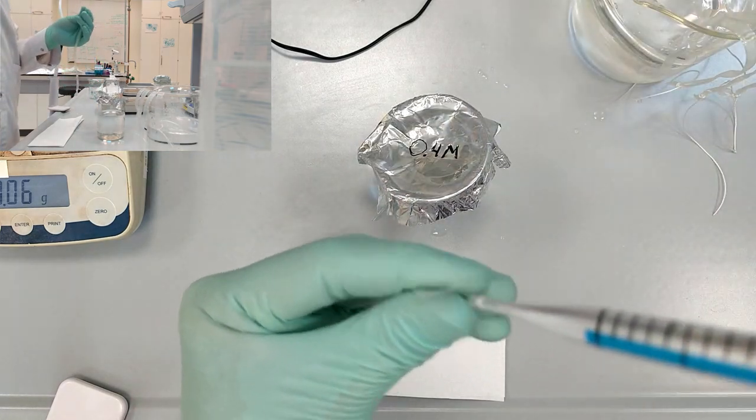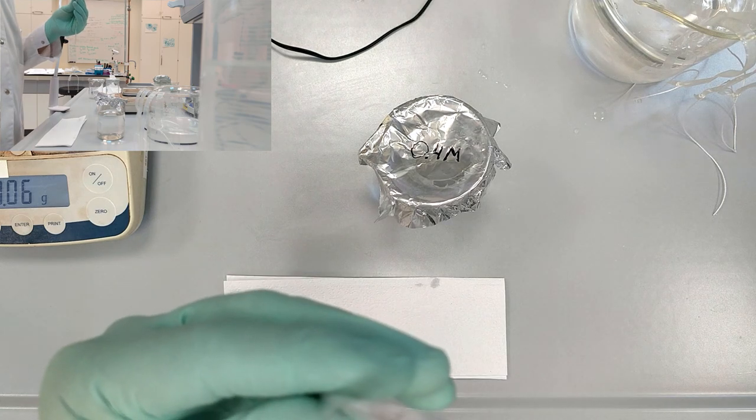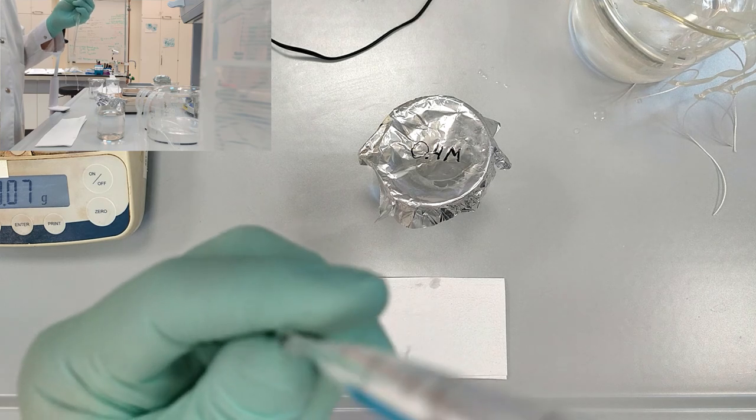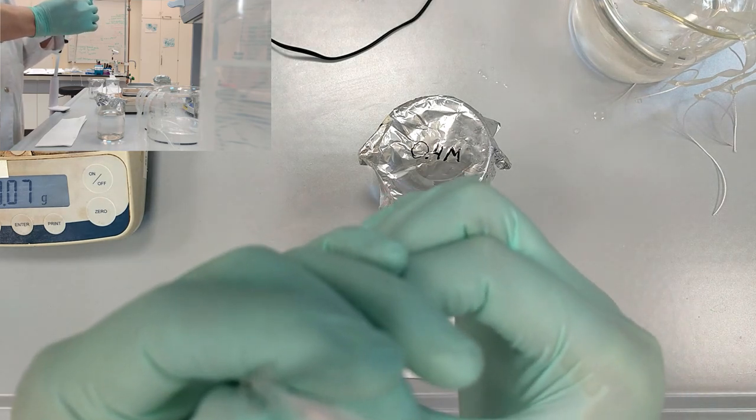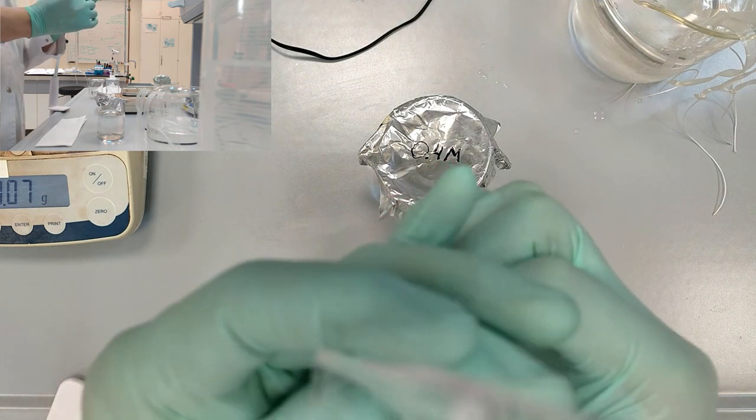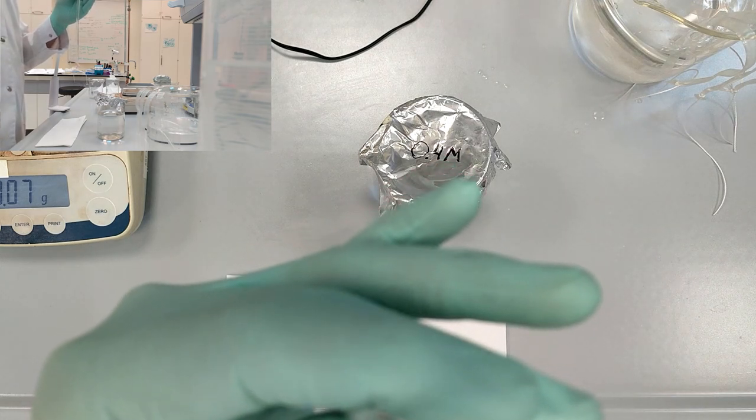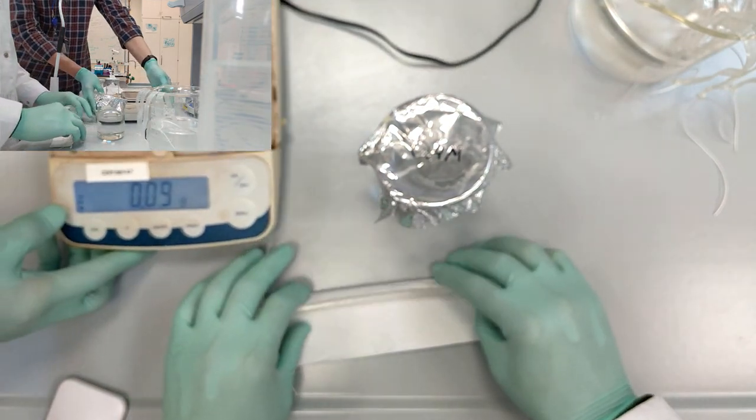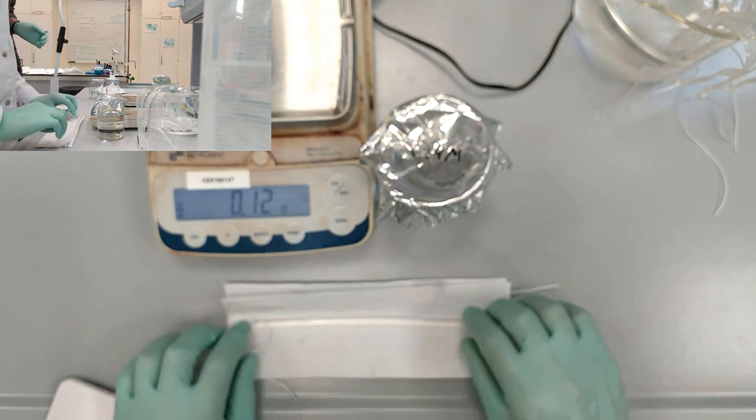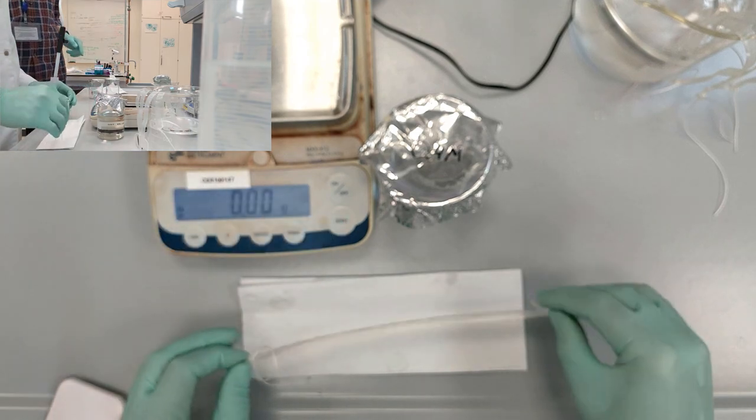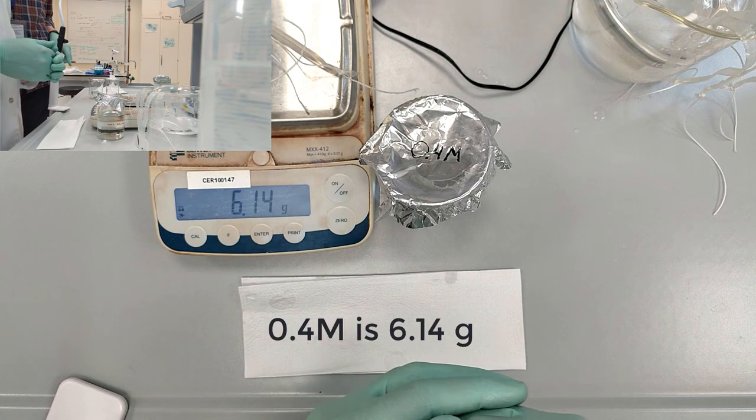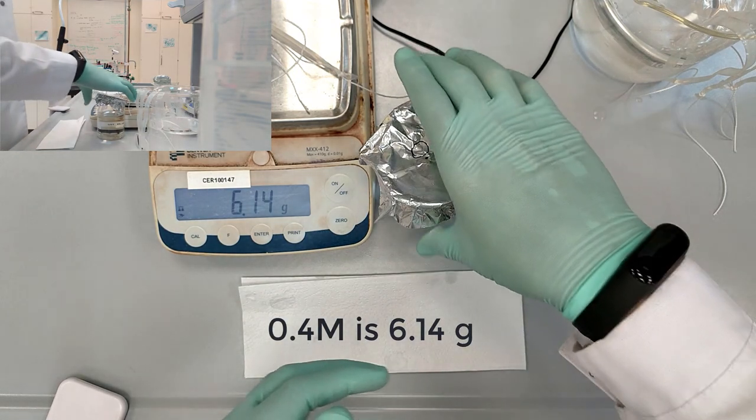Put the dialysis tube, close the open side. Make sure it's dry. Zero the level of the scales and place it on the platform. So for 0.4 molar concentration the mass is 6.14 grams.